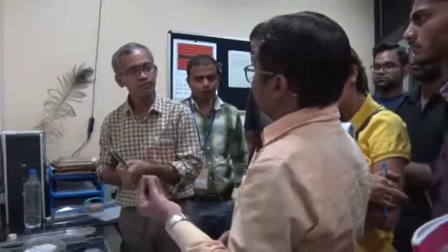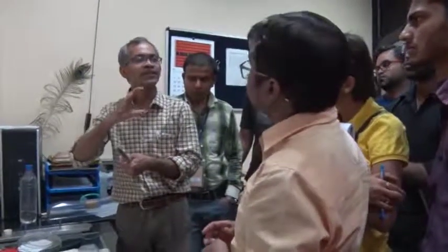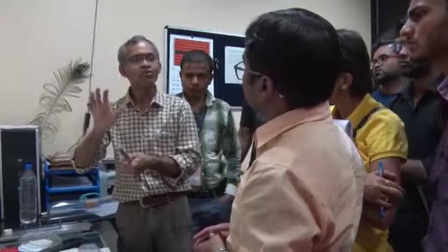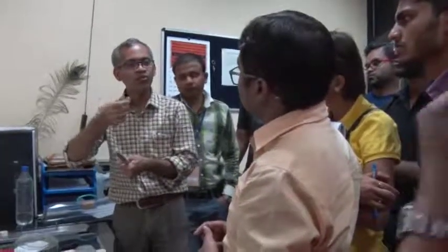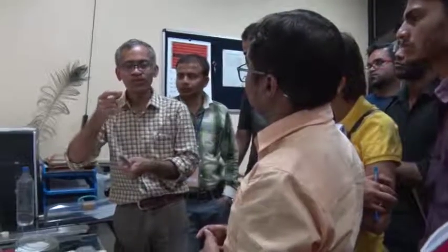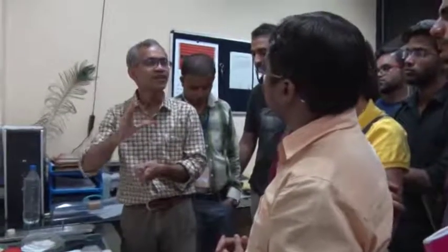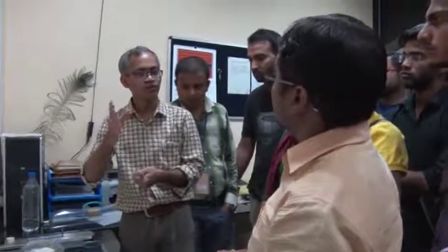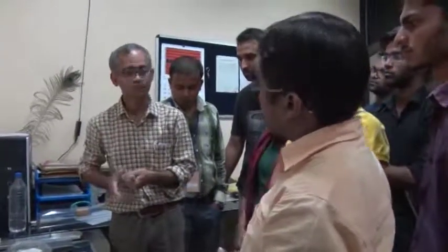So sir, let's suppose we want to use only one zone axis, then in which holder should we put our sample, double tilt or not? See, for any sample if you are interested in tilting, it is better to use double tilt, because even if you want only one zone axis, even then at least you have to go to that first zone axis. Therefore, if you want to do any tilting experiment, it is preferable to use the double tilt holder.